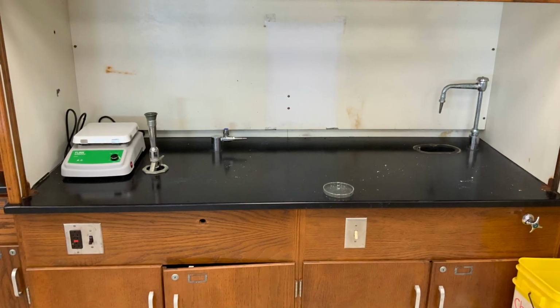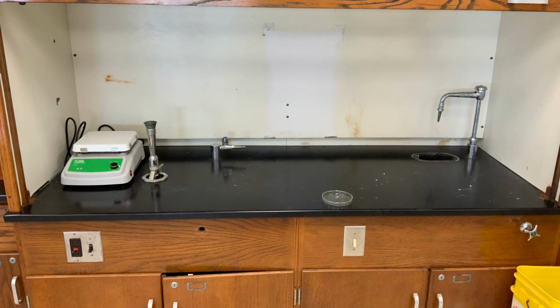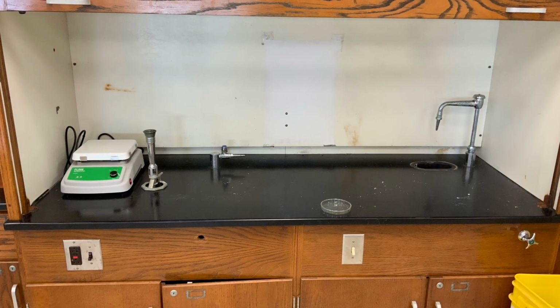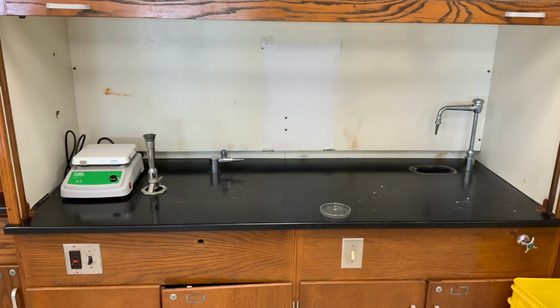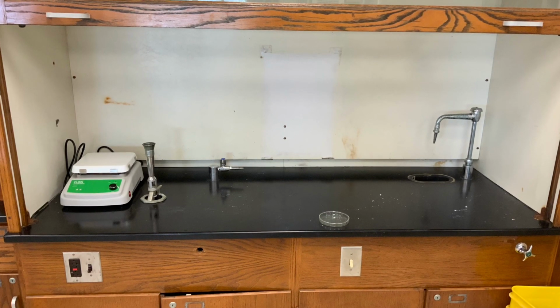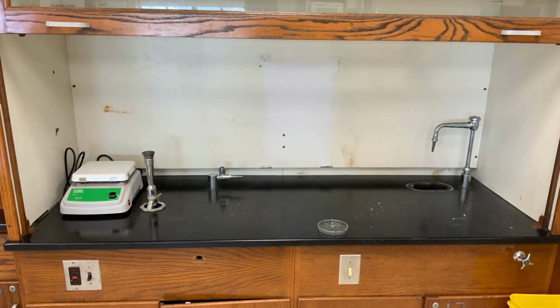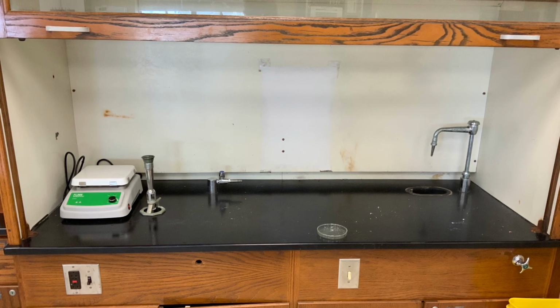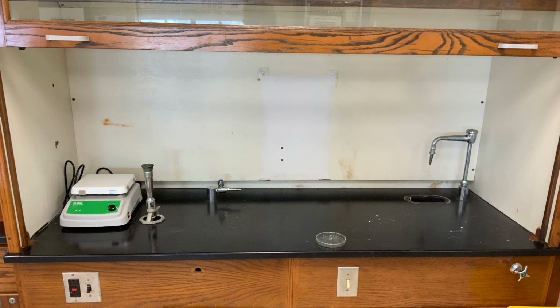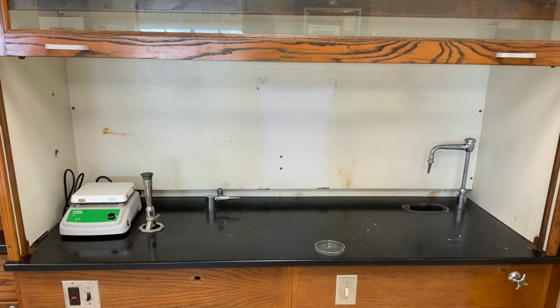Up next is the chemical fume hood, and this is used for any experiments that may be dealing with potentially dangerous chemicals that may be released into the air. The experiment will go on within the chemical fume hood, and the glass will be lifted down so that the fumes are not released. Then once the experiment is over and the dangerous chemicals have been released, a ventilation system at the top of the fume hood will get rid of all the dangerous chemicals from the fume hood to make it usable again.